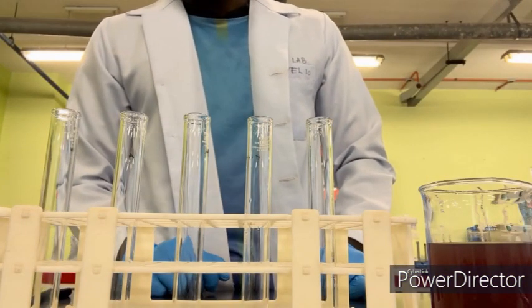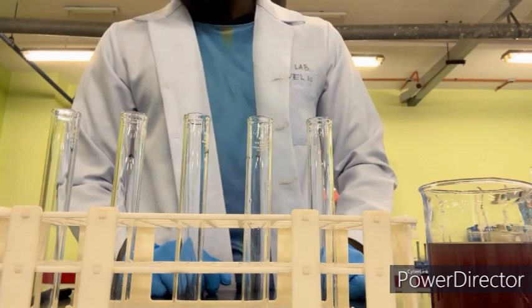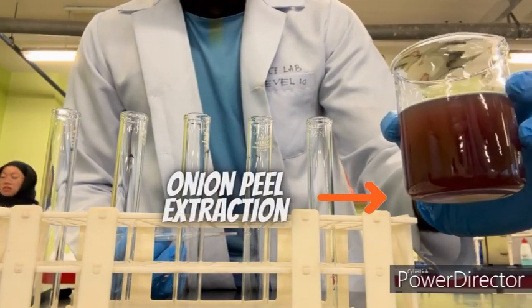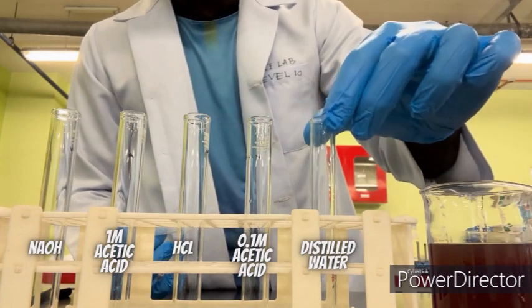I'm doing a colorimetric experiment to determine the concentration of an analyte by comparing the color changes of the solution. So we have our onion peel extraction, and we already have the solutions here.